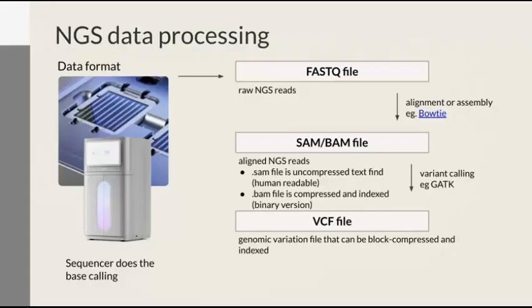So this is pretty much our next-gen sequencing data processing workflow. There's a lot more to this, but as a whole, this is what we're going to observe, where we take our raw reads from our sequencer.